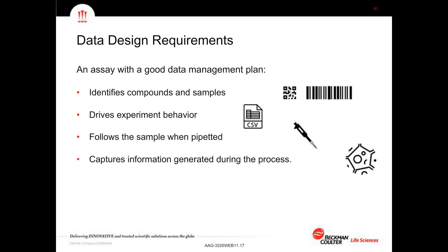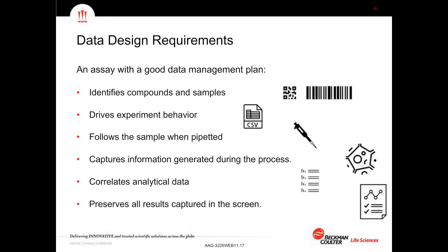It will correlate your identity, your traceability, and your analytical information, and then preserve all of that information so that you can report on it and drill down, process that into the next system. So hopefully today you've learned something about designing a system and some of the components that go into the hard side and into the capabilities required for pipetting and managing cells, but also how to make a data management plan so that in the end your system can process 2 layers of samples. You have integration both in the hardware and in data management.